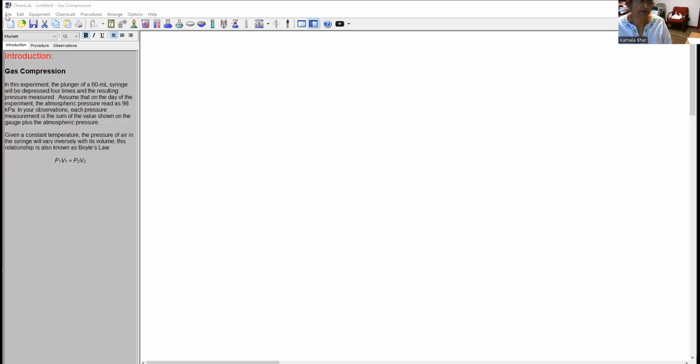You will be using the ChemLab simulation model. As you go along, since you might have taken General Chemistry 101, I'm assuming that you have the program with you. Open the ChemLab program by clicking on the shortcut showing a man in a lab coat. As we go along, I'll show you. Click on that man, and you'll see the following screen that is available to you.